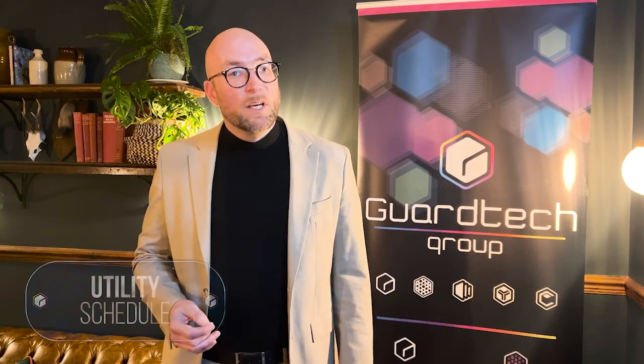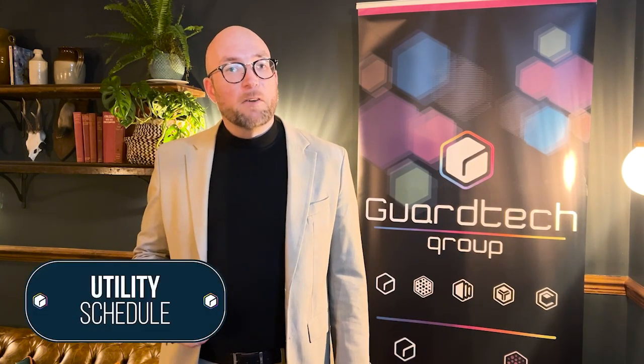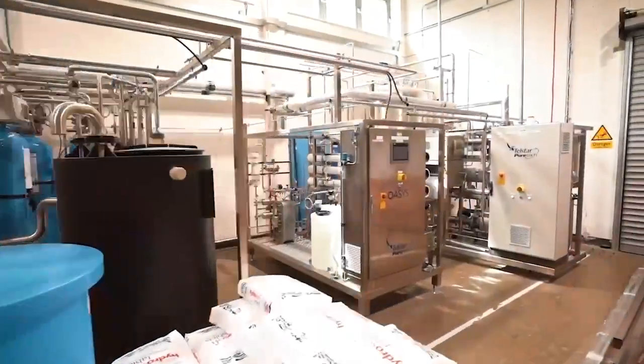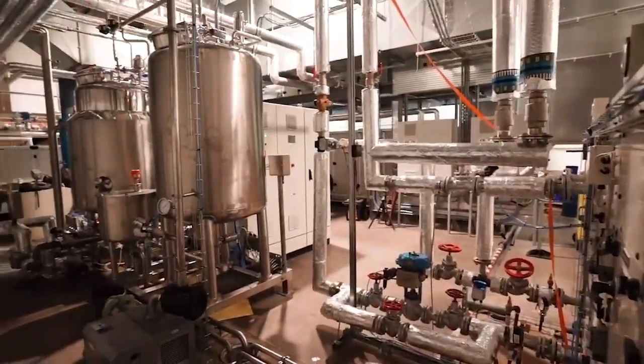Utility schedule. Following on from the equipment register, defining a full utility schedule for each piece of equipment. What power is required to the kit? Does it require gas services such as nitrogen, compressed air, vacuum or extraction? And defining the associated flow rates. Is water or drainage required?